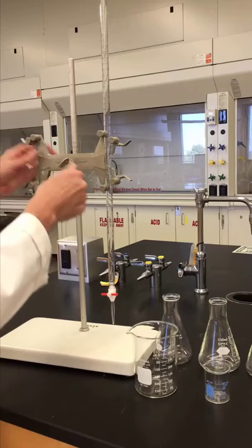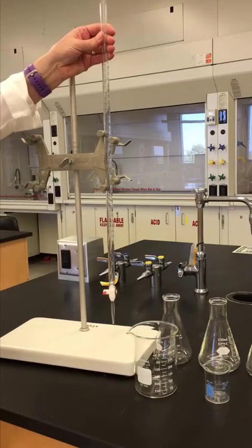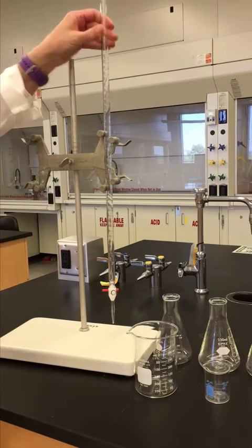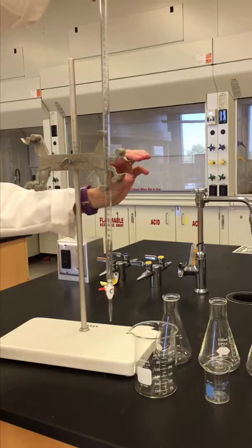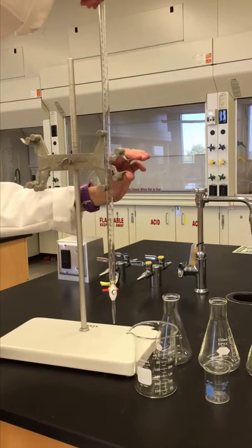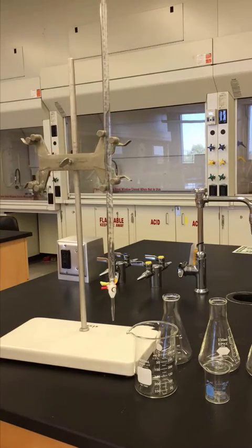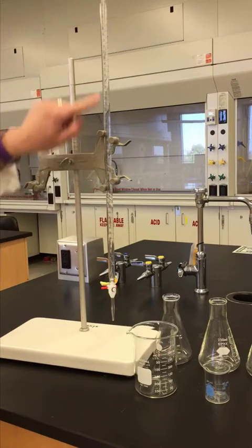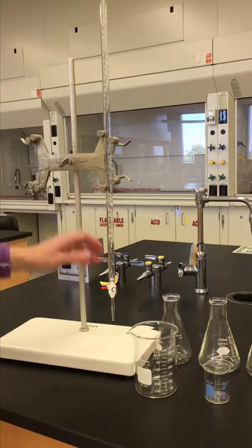The burette clamp holds our burette, and the burette clamp is special in that the way we clamp it is that you do not cover up the numbers so we can actually see the numbers.